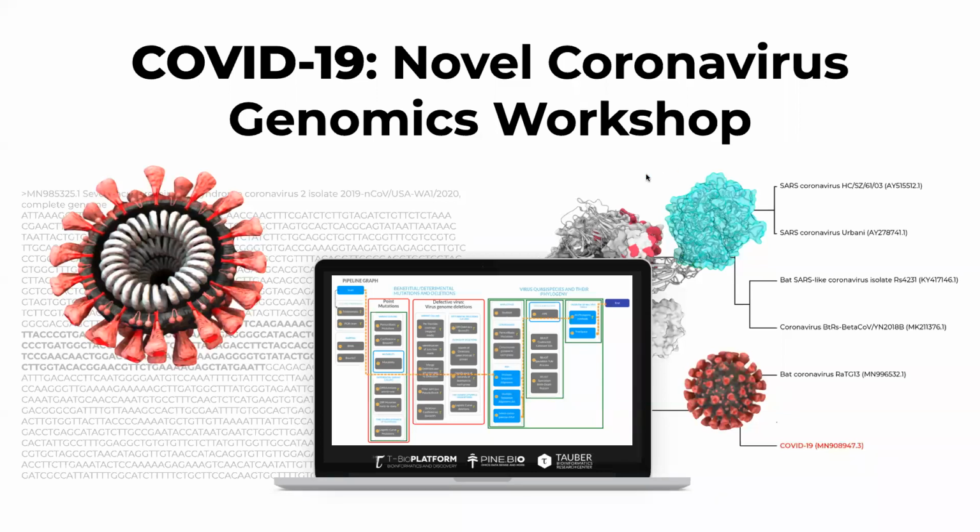And then how do we understand the biological significance of the different variations that we actually find? And in the middle, you see some of the tools that we'll be talking about. And some of those tools include multiple sequence alignment, as well as phylogeny, how to study relationships of these different viral sequences.